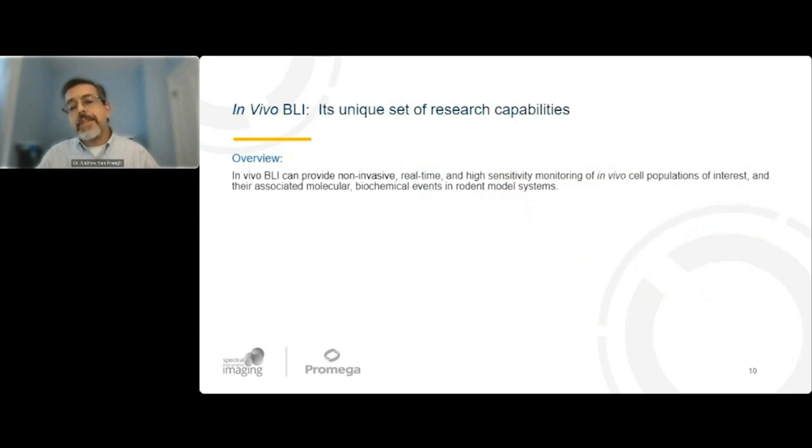Now, the next question is, having set this up and knowing that you're empowered with the ability to do in vivo BLI, what does this really give you? Essentially, in overview, it gives you a non-invasive, real-time, high-sensitivity monitoring capability for the cells of interest in your model. The exact advantages this gives you will be elaborated in the next set of slides.